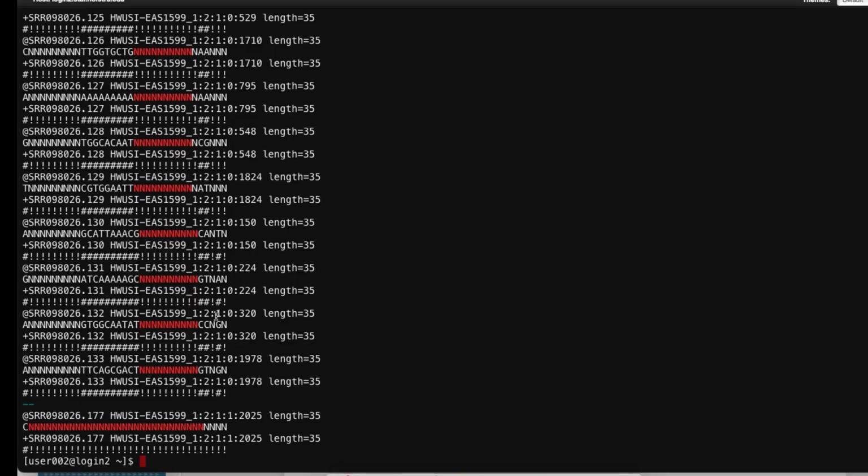So we're going to use the same exact command, so we can use the up on our keyboard. And we're going to use a greater than symbol. A greater than is a redirect. And so this is telling the computer, I want you to save the outputs of this command rather than just printing them to the terminal, save them somewhere else.